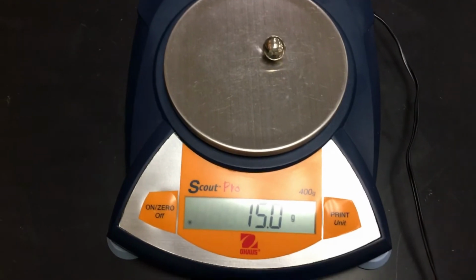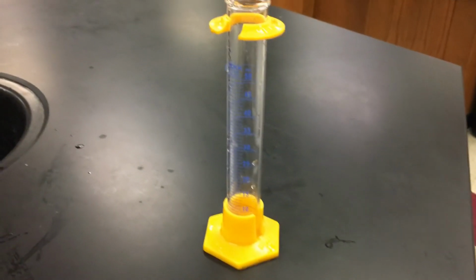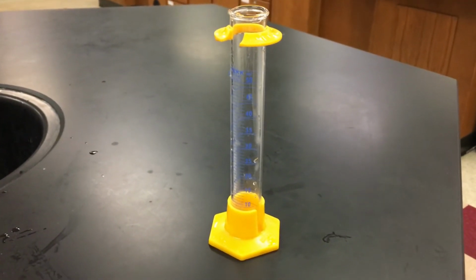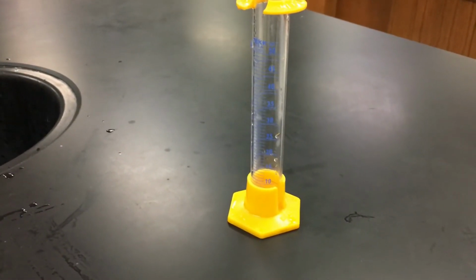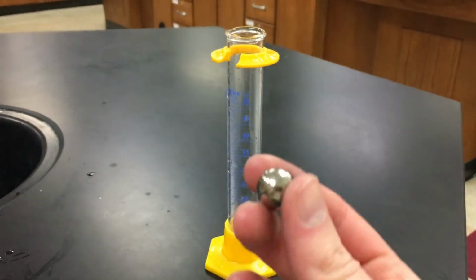So I've got that. Next comes the volume, which is something I have to get a little clever with. Now, if we had a nice block-shaped object, we could do length times width times height in centimeters times centimeters times centimeters. That would give us cubic centimeters, and that would be a volume, which we've done before with a block. In this case, I've got a marble.